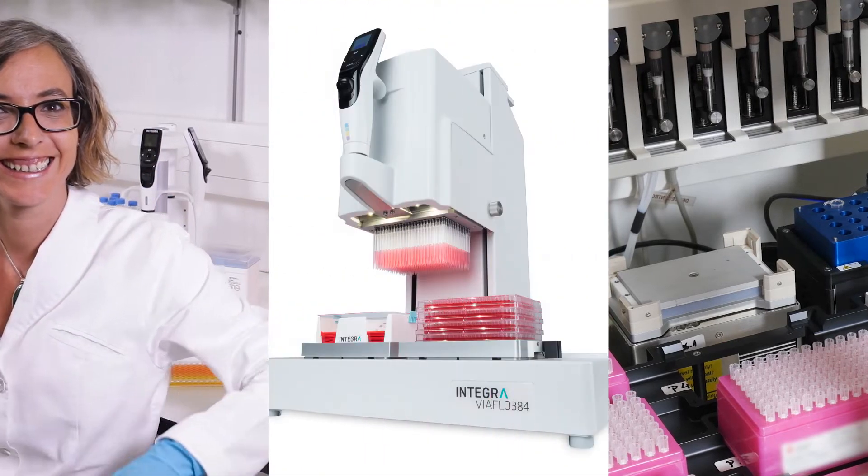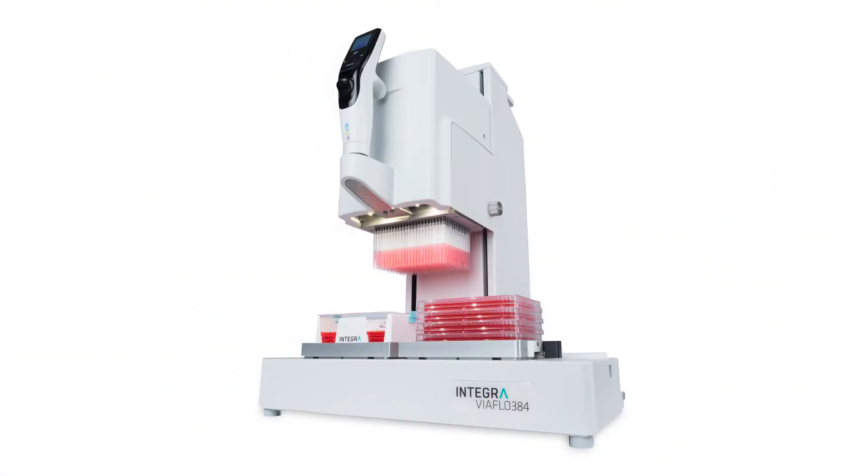Presenting the ViaFlow 96 and ViaFlow 384. A handheld pipette which provides a much higher throughput, all while delivering extremely reproducible results.